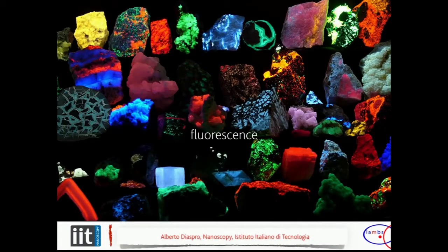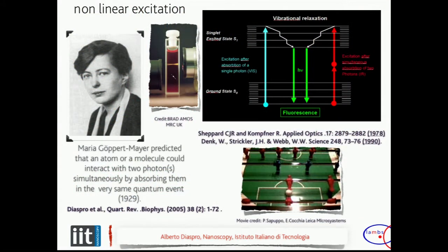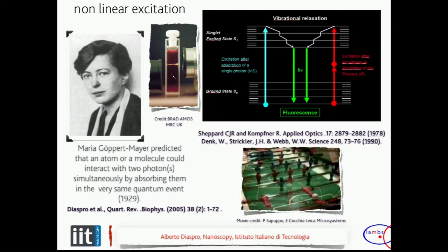Fluorescence again. Now, you heard about, I assume that you had some lessons from the optical side about two-photon excitation. But in this case, we are interested only in one aspect now, later on the other aspect about the instrument, but now about the fluorescent molecule.